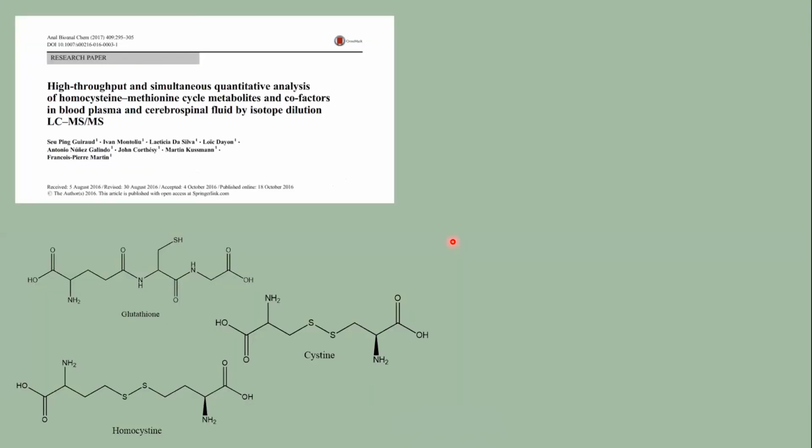During the implementation of this method, it was clear that the easy sample preparation and short runtime make this method alluring. However, it is known that the use of ion pairing agents causes the suppression of ionization.